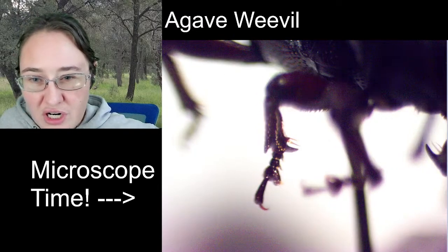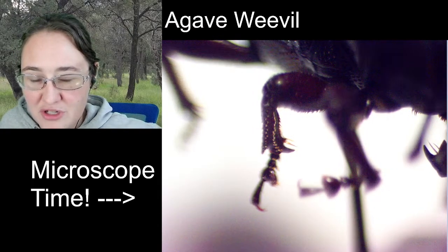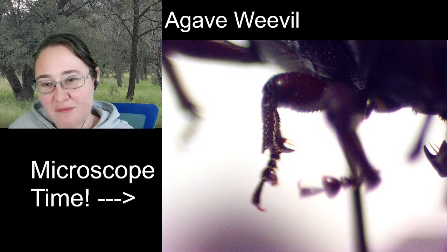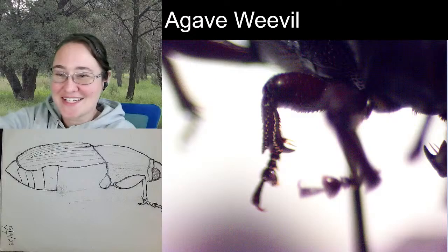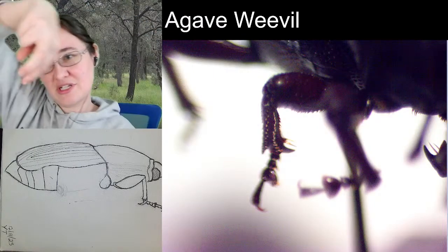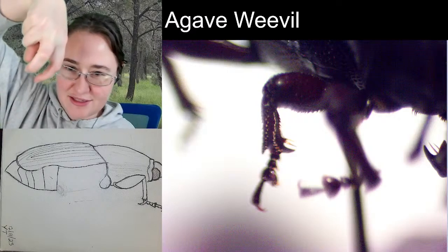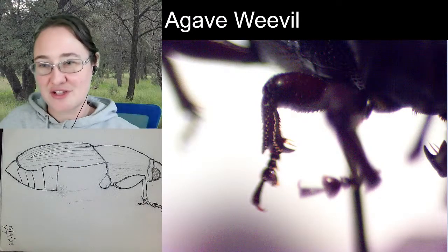So for our middle leg, honestly, it is very, very similar to our front leg, except that our middle leg also has a forward-facing spine, which is awesome. So they've got the two that go backwards, like this, and they've got one going forward and the tarsal claws going underneath.